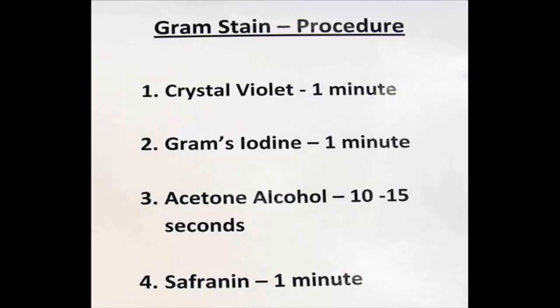The second step is to apply Gram's iodine. This is a mordant that will bind with the crystal violet. I leave that on for one minute and then I rinse.